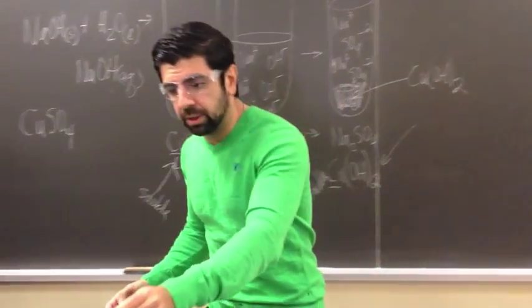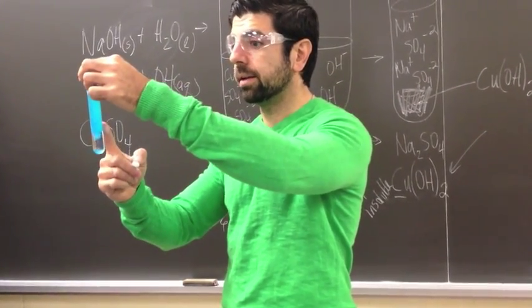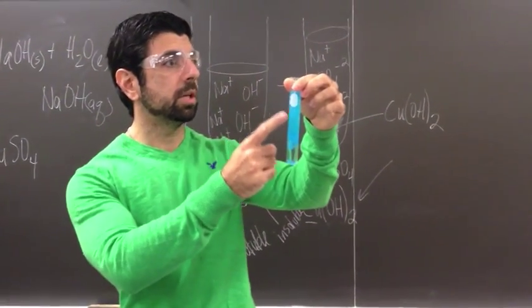Okay? So if you notice here, so that dark blue, what do you think that is? That's solidifying. The copper 2+ hydroxide.